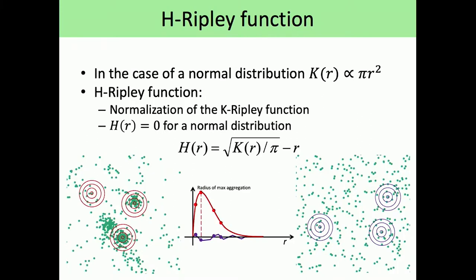an analysis of the density of my molecules as a function of distance around each molecule. You can see that when it is homogeneous, you have a flat distribution around zero. But when it is clusterized, you will have an increase with the radius, similar to what Wesley showed before. And if you have just clusters of homogeneous size, then you will have a peak and a decrease, which will give you the rough idea of the radius of your clusters.